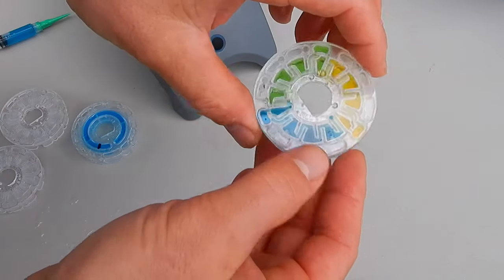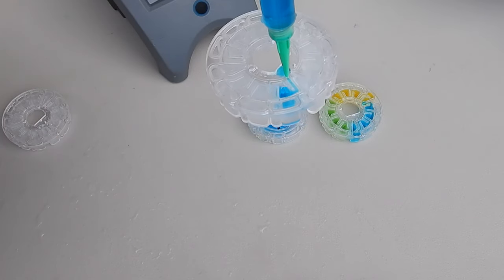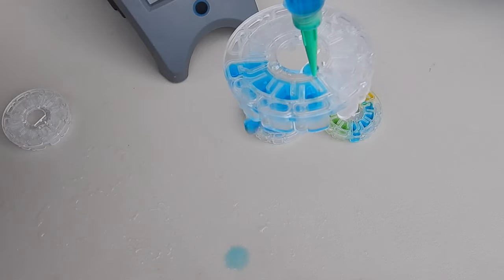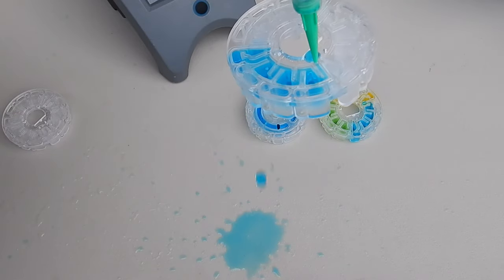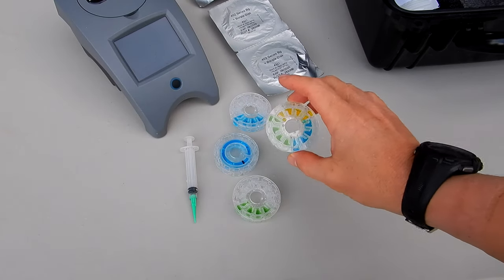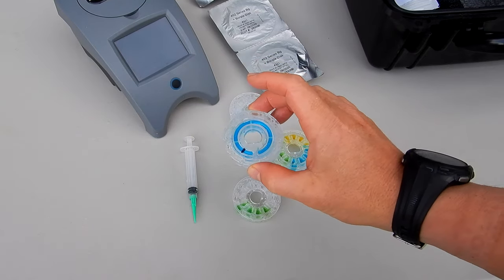You can see the distinction of each chamber — each one ends with this little arrow-type chamber. If you were to overfill the chamber, this is what it would look like — you'll see the excess water dripping out. That's a look at filling the spin disc for the Waterlink Spin Touch. It's a pretty easy process once you practice with some food coloring inside the syringe.